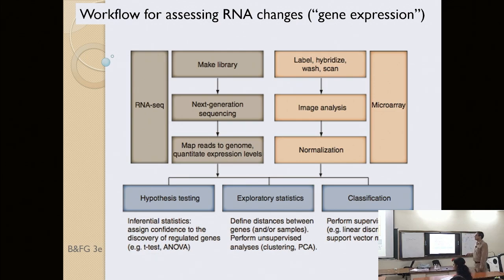Okay, very good. So this will result in hypothesis testing. So you have found that there is a difference in RNA abundance in a certain gene between a healthy individual and me. But you would want to assess whether this difference is statistically significant or not. Is it arising because of a biological reason or just by random biological variability? Okay, so you want to assess the statistical significance of this difference. So that's hypothesis testing.